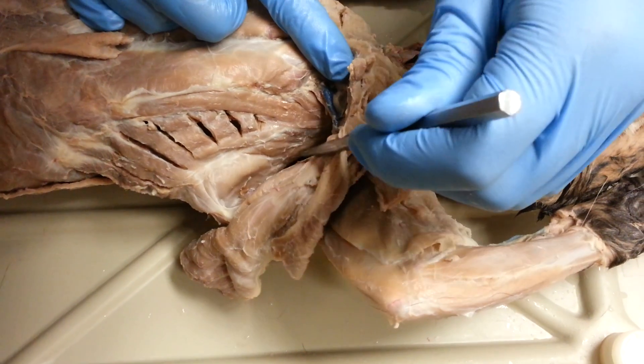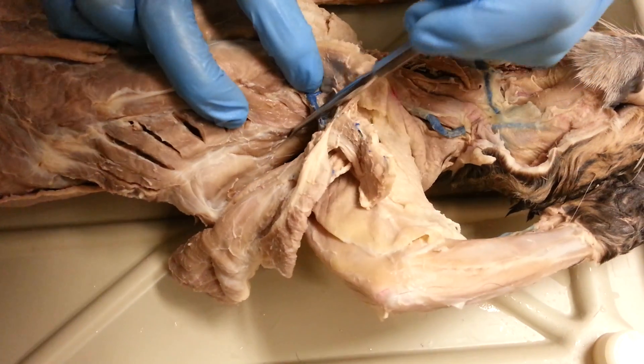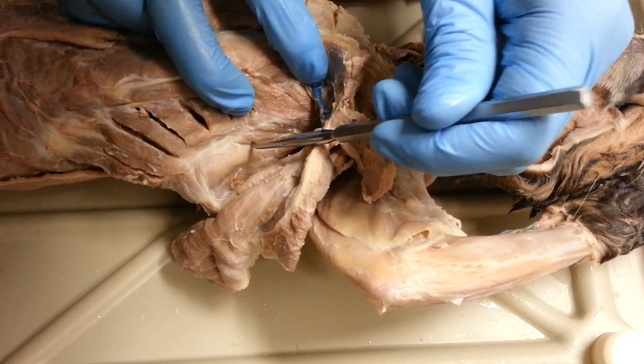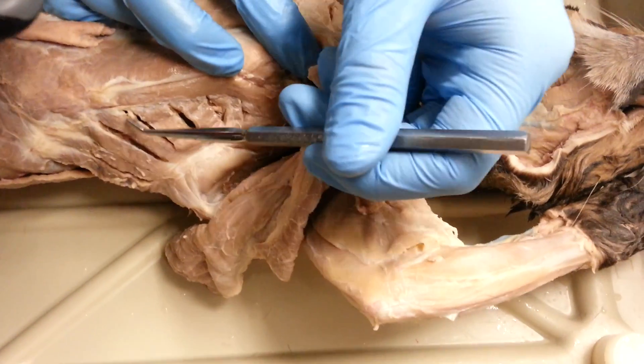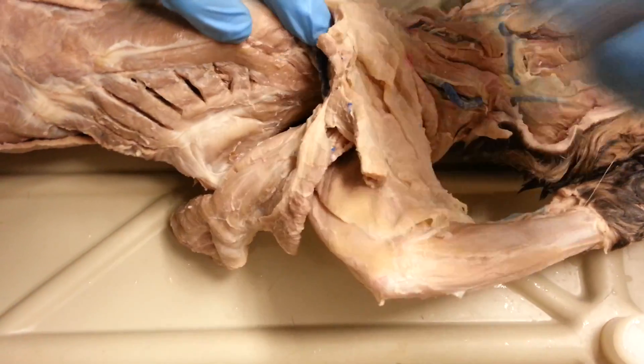Then there's levator scapulae dorsalis, which is wedged in here — sort of hard to see, and I can never really find it very well. I believe it's this muscle right here. And then we have serratus ventralis, which is this fan-shaped muscle right here.